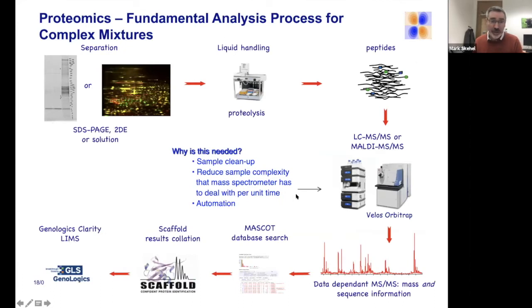Right, so proteomics. In the lab, we focus mainly on bottom-up proteomics. And what is it good for? Well, looking at protein-protein interactions, looking at expression levels in cells, either from a disease or from a drug treatment or from a mutation of some particular pathway. But we generally go for bottom-up proteomics.